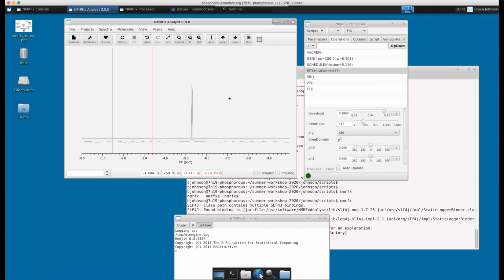The other one I mentioned, GRINS, is my silly recursive acronym: GRINS is not SMILE. It's inspired a little bit by IST and by the SMILE algorithm, which you may have heard about from Frank, and you'll hear again in the later workshop if you watch that.